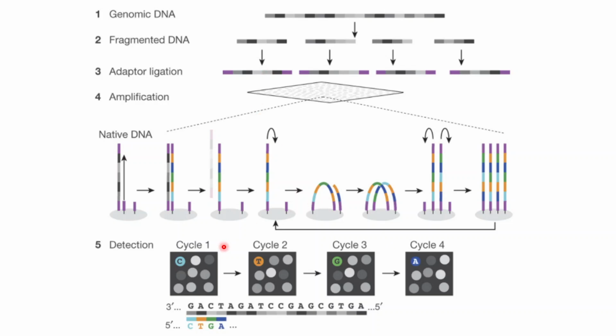So once you get the data of the forward and reverse reads, that is the sequencing data from the SRA database or directly from the sequencing platform, whether it is .SRA or FastQ, it doesn't matter. Once you have got the sequencing data, you have to do a quality control, meaning that you have to remove any genomic DNA contamination other than the organism you are looking at. Then you have to do primer and adapter removal, because the adapter is present here, right? We know the sequence of the adapter. So if you know the sequence of the adapter, then from the ends of the reads you can remove it using computational tools.